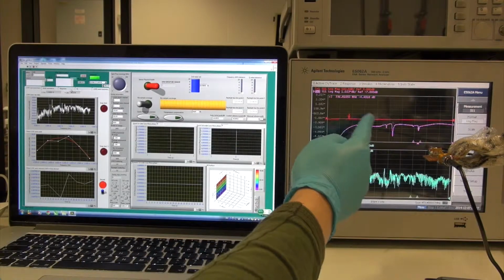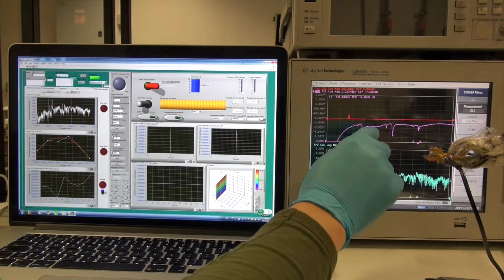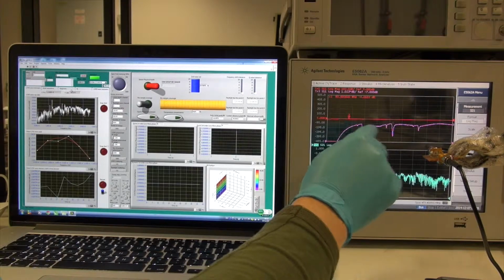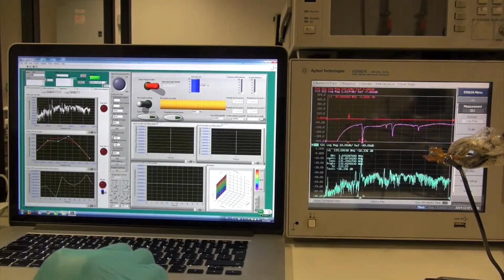And in the reflection coefficient, we use the third order for the temperature compensation. So it tracks both the first order Love wave resonance and the third order Love wave resonance. And on the computer side, you can switch the function modules on and off separately.